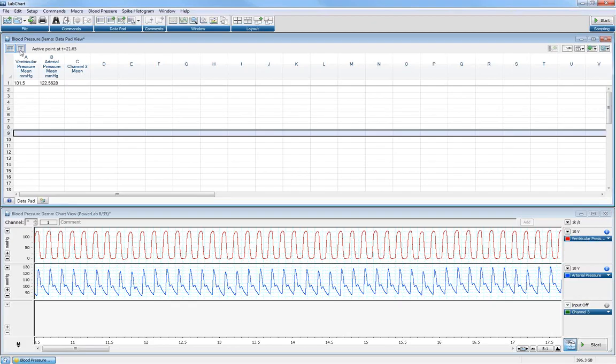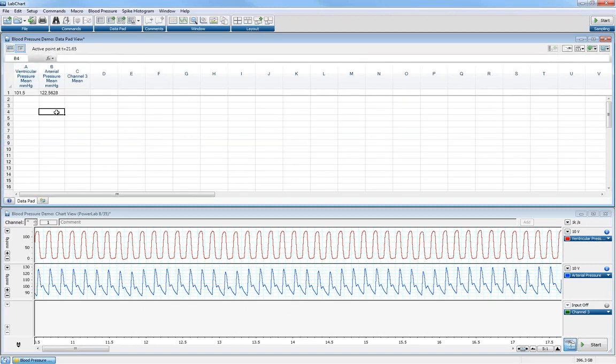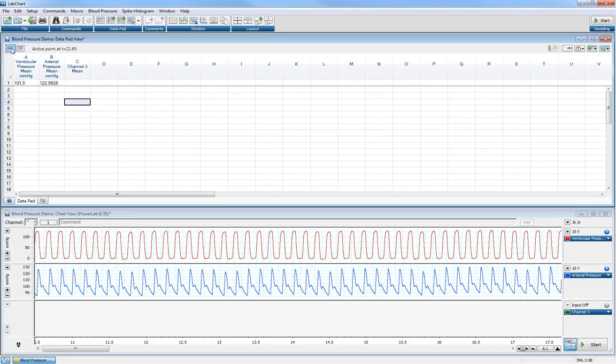There's also another mode called cell edit mode, and again we'll be using this towards the end of the webinar, in which each of these cells can be accessed individually. We can use this mode to perform additional calculations on our data. I'll be going into cell mode in more detail a bit later on, so we're going to stick with row mode at the beginning here.